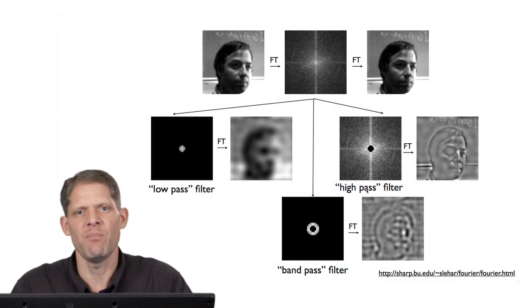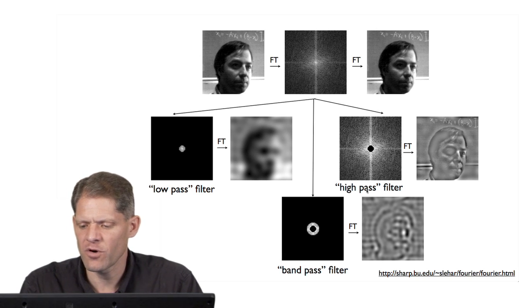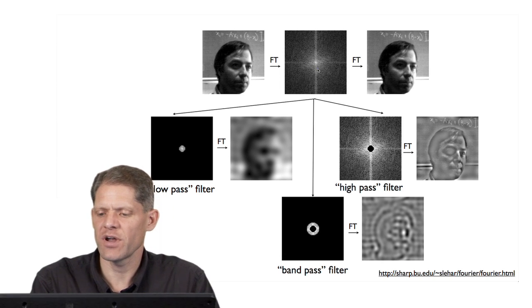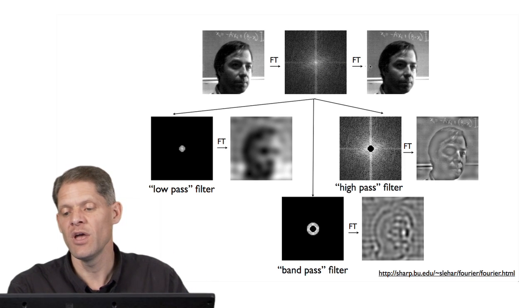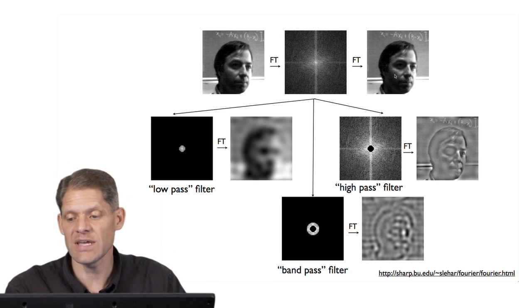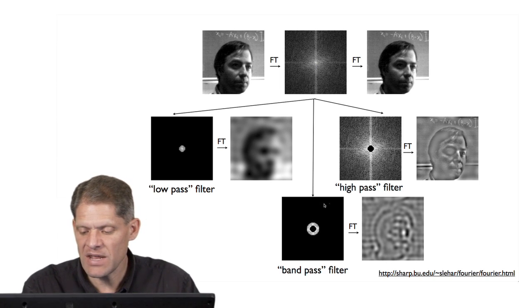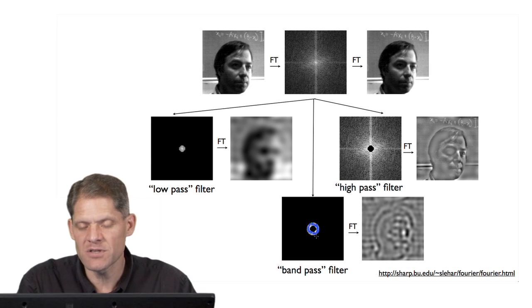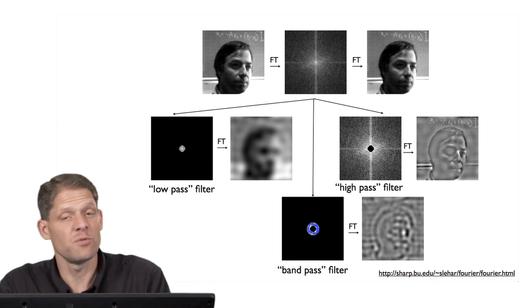And so to remind you of what band pass filters are, remember this slide from the module on Fourier transforms, where we talked about that if you have an image and you calculate its Fourier transform, and then you calculate an inverse Fourier transform, you recover the original image with all its details. If, however, in Fourier space, you mask out many of the spatial frequencies, you essentially zero them out, and you only transfer a small band of Fourier components, then you add those up together to produce a new image.